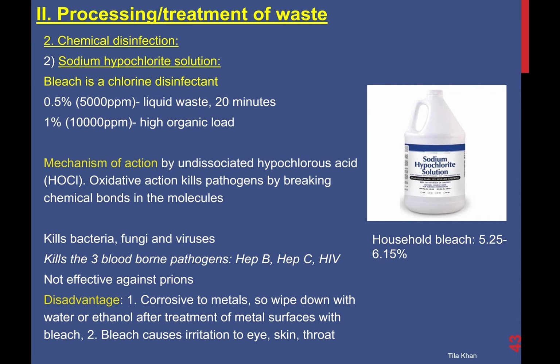So if you have any contaminated metal surface that you want to disinfect, please use bleach for disinfecting the blood contaminated or body fluid contaminated metal surfaces. But again, prions are an exception. Prions are very resistant proteins which cannot be killed by bleach solution.